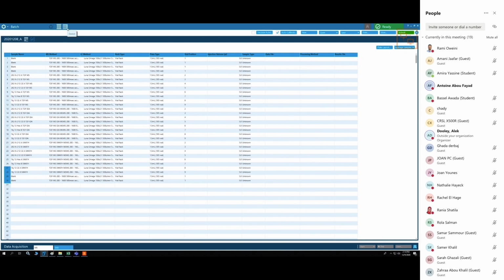Yeah, that question actually didn't come up. Yesterday we were in a little bit of a rush. Right now we only have positive methods, so we didn't talk about negative. But absolutely, I would agree with you that you should have several blanks. The instrument probably needs at least 5 minutes to settle down between positive and negative mode. So I would do 1 or 2 blanks definitely to allow the instrument to settle down.